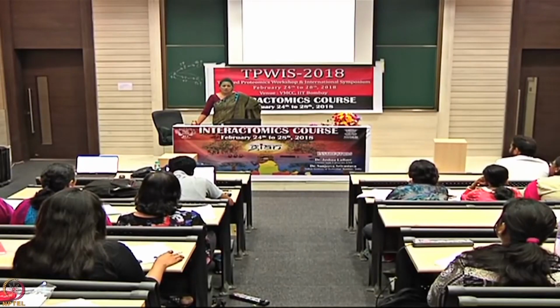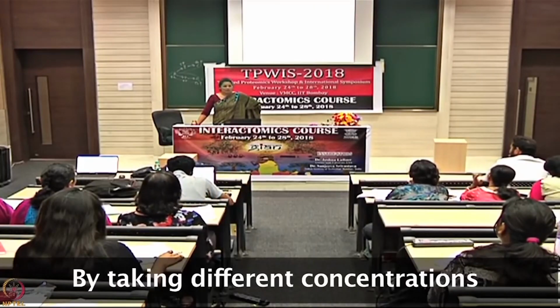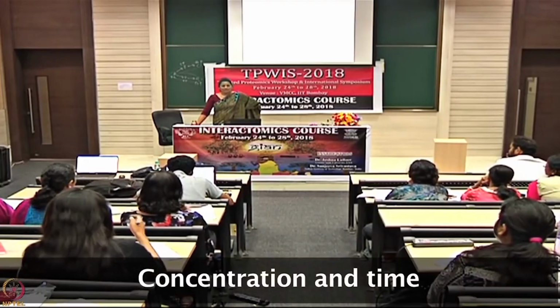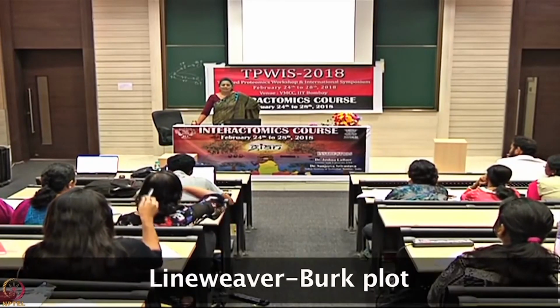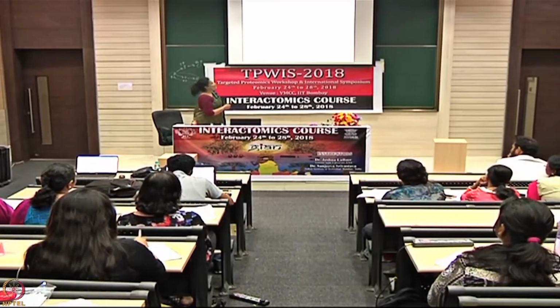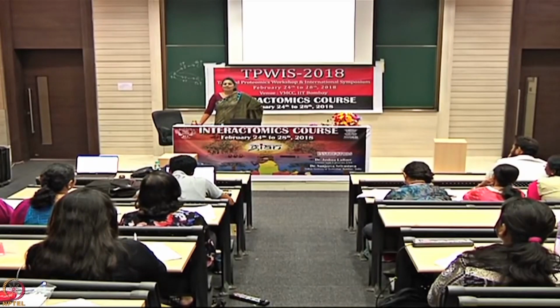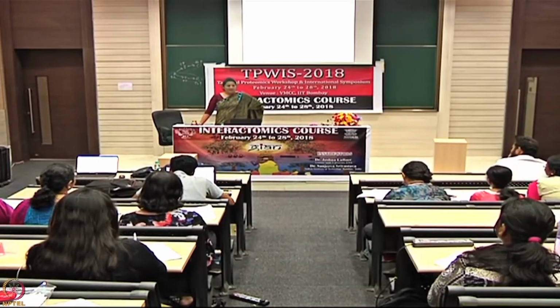Steady state measurement. How do I do a steady state measurement? Different concentration. And what do I plot? How does it look like? Very nice. So you guys are experts here, huh? So then there, do I need equilibrium or do I need saturation? Do I need saturation? Very nice.